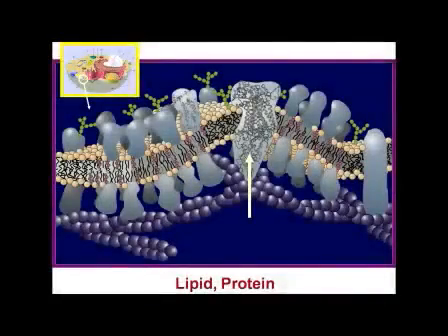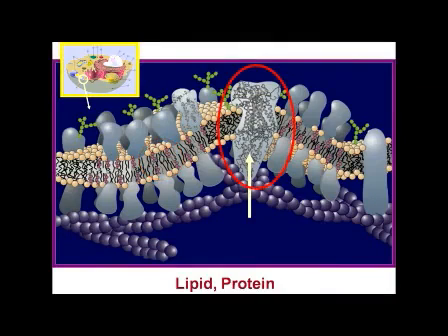The focus of our research is the biological membrane, a schematic of which is shown on the first slide. The membrane, which surrounds the cell and subcellular organelles when present, is a molecularly thin structure just 2 lipid molecules across and studded with proteins. We are interested in structure and function as applied to both lipids and proteins.